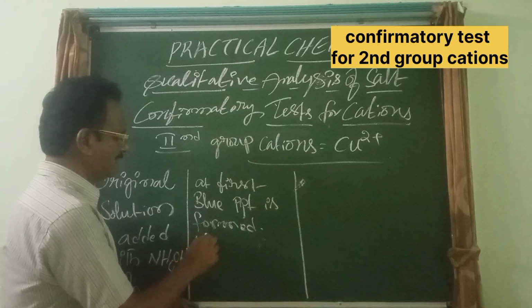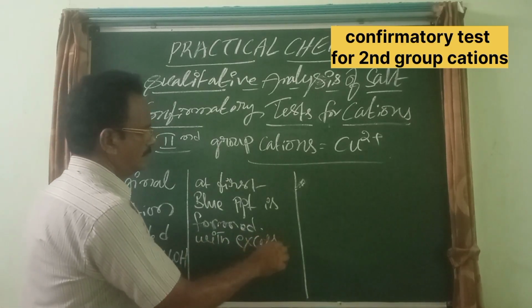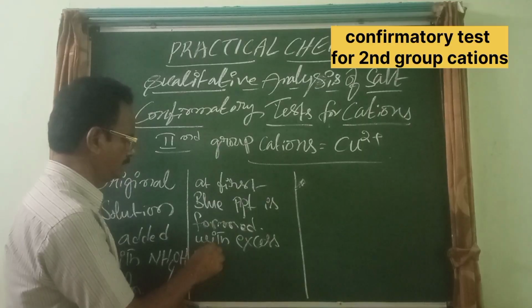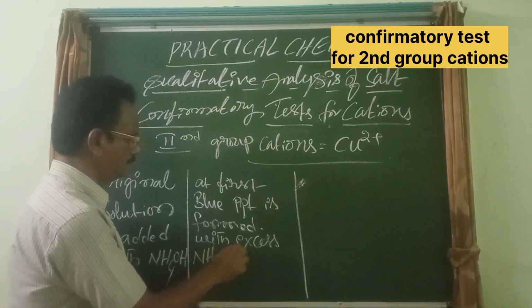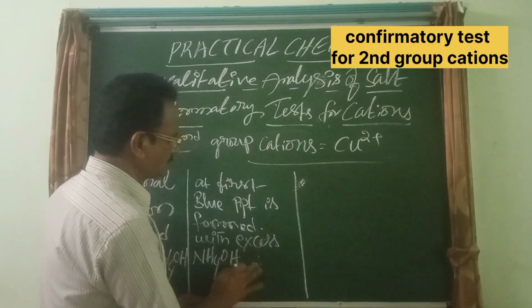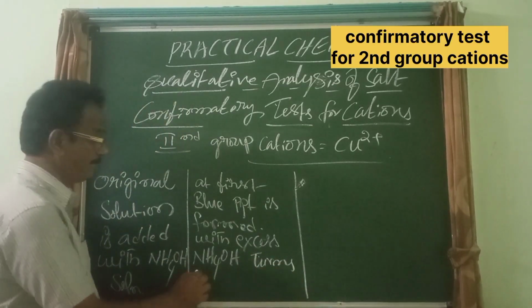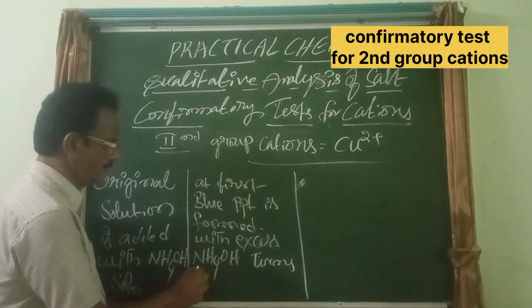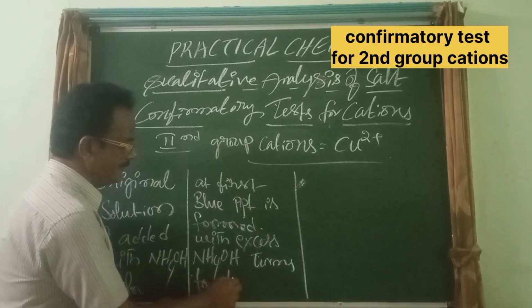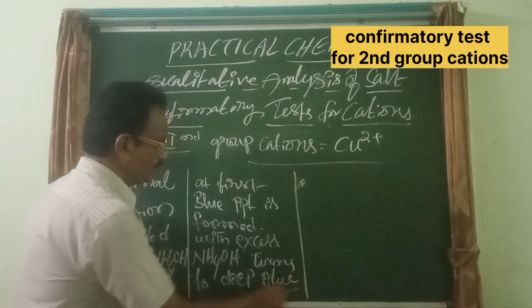Okay, with excess ammonium hydroxide, it turns to deep blue. Keep in mind, deep blue.